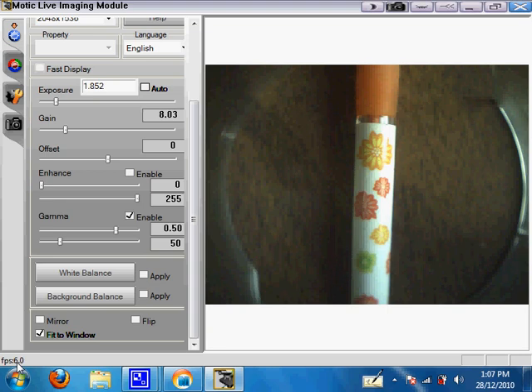And that's how you get your Motic Cam or Motic microscope up and running. Thank you.